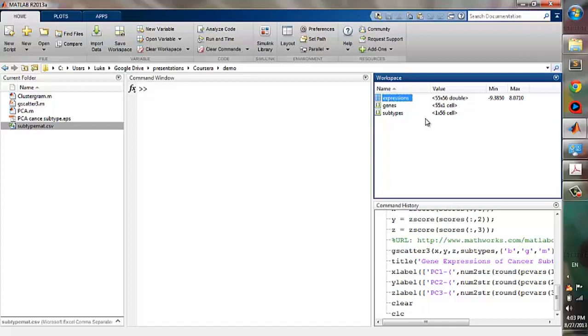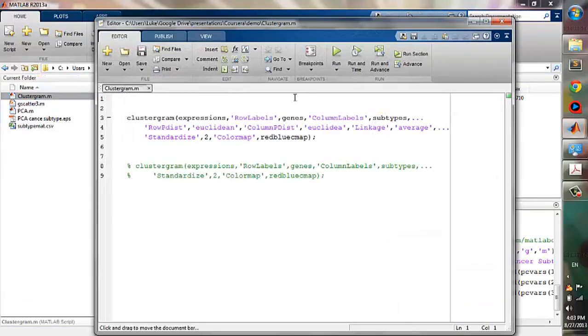The name of this function is clustergram. I will open the script I already wrote, and the name is clustergram. The first input argument is the expressions matrix, then we will specify all the properties. The first one is row labels, we will give it the variable genes.